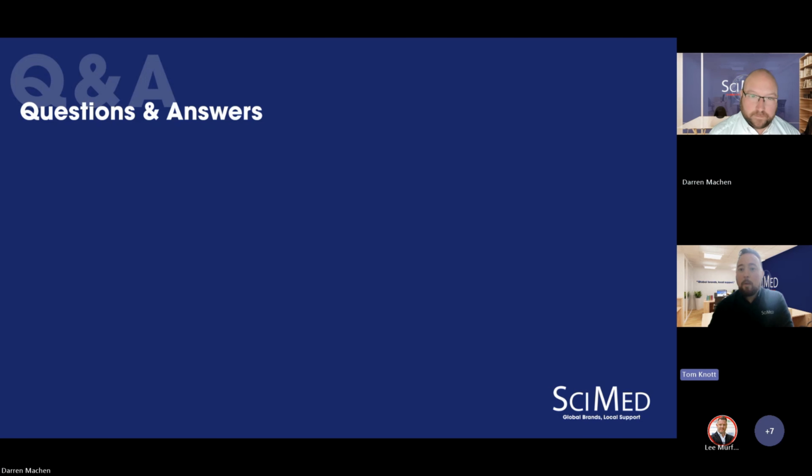So yeah, my answer is very similar to answering from the XRF side. I think I'd already highlighted that there are some reference materials out there for certain standard sorts of feeds and materials, but as formulations develop, they're becoming harder and harder for complex matrices. So it's much more common for either external lab data or other techniques available in on-site labs to supplement known materials that are akin to the sorts of feeds being developed by that particular organization or company, and use that as part of either the full calibration or the matching library sort of tag standards that I highlighted. So yeah, it's getting more frequent that these sorts of secondary references are being developed in-house.